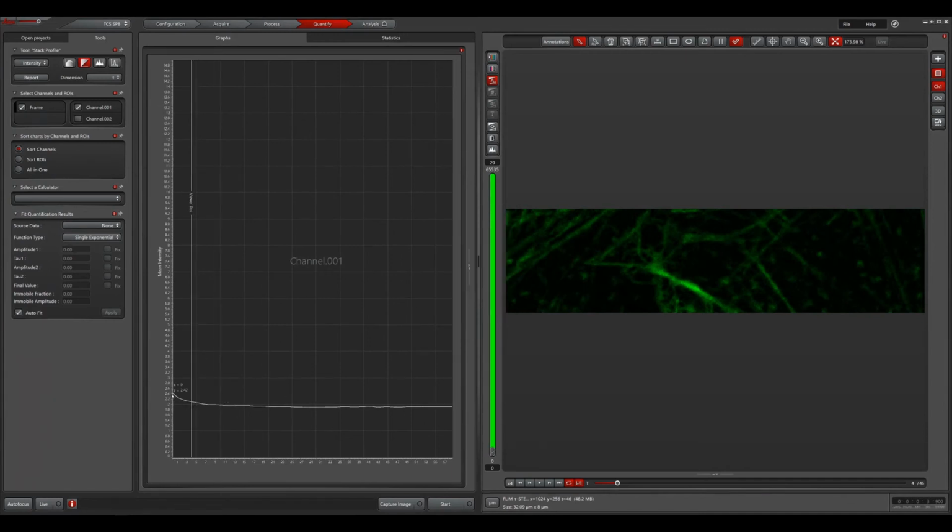And if I do that, we can see that when we started this acquisition, we had an intensity over the whole image of around 2.4, which then reduced slightly to around 2, as we can see here. But then from there on, it actually remained pretty stable throughout our time series, even though we were acquiring at a really high temporal resolution and acquired in total 46 frames.